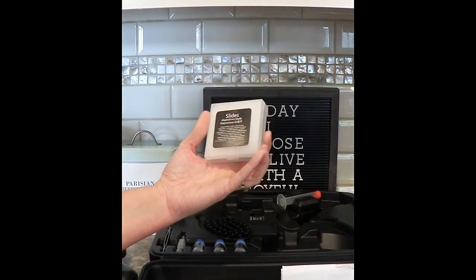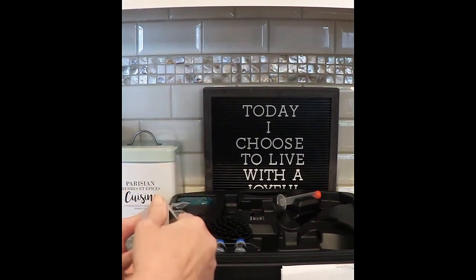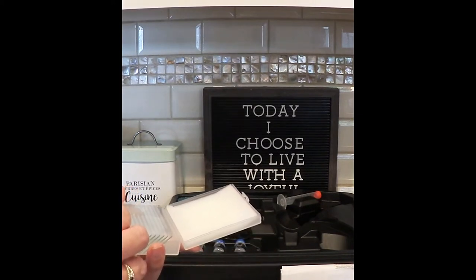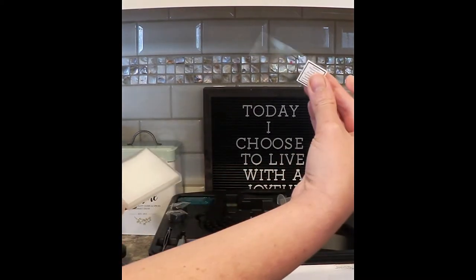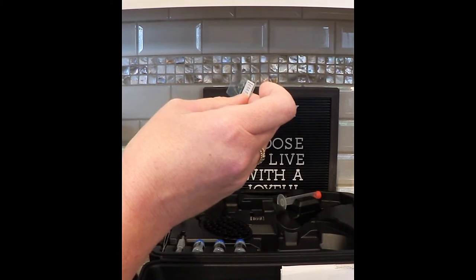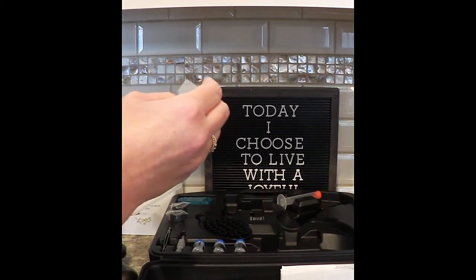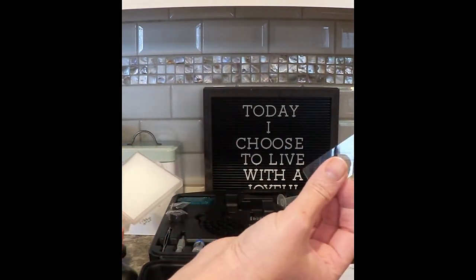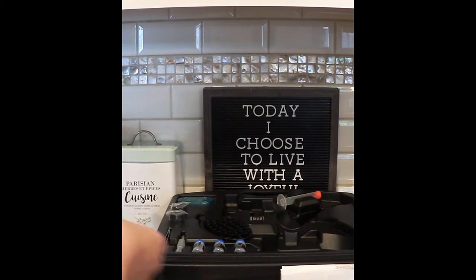Slides in here — these have three prepared slides. In the front we have what looks like algae, plant stem it looks like, and lily pollen. But we have a bunch of prepared slides, and then there's a bunch of blank slides for kids to make something.